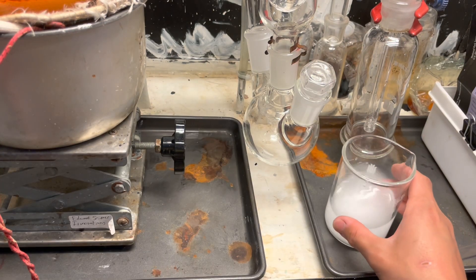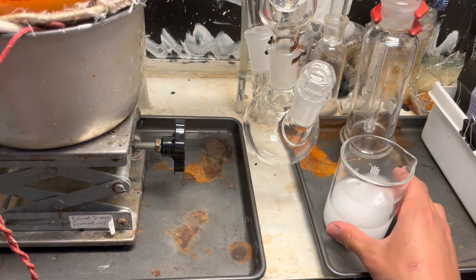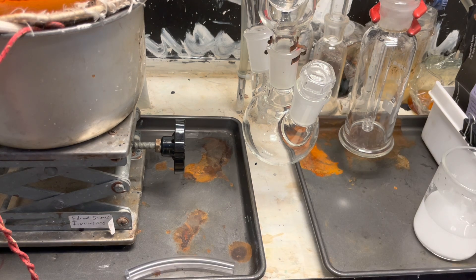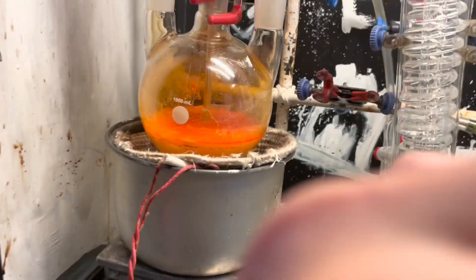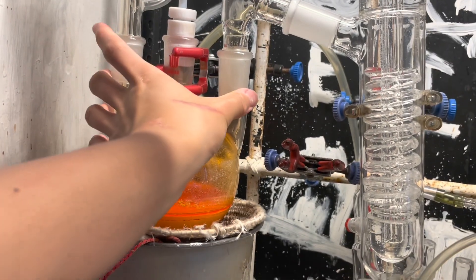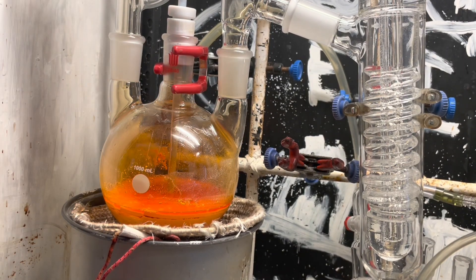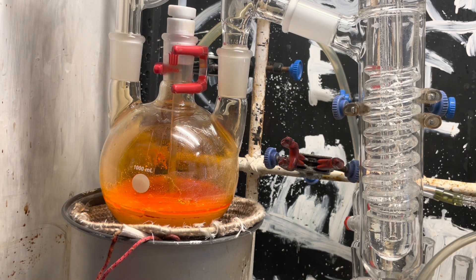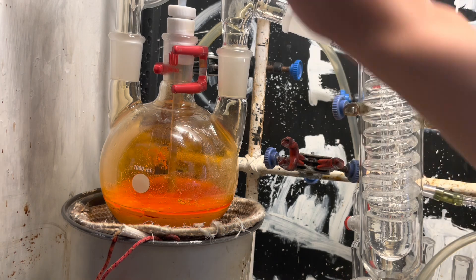The metabisulfite actually forms sulfur dioxide gas upon reaction with bromine, so it's quite annoying. Now it's time to start the reaction. Unfortunately, due to me choosing a fancy flask that has the neck going upward instead of sideways, I can't actually fit my stirrer on top of it. However, I can still stir it by hand, and that's good enough.